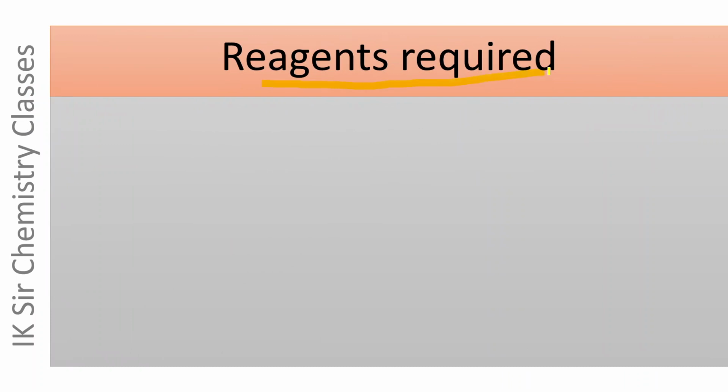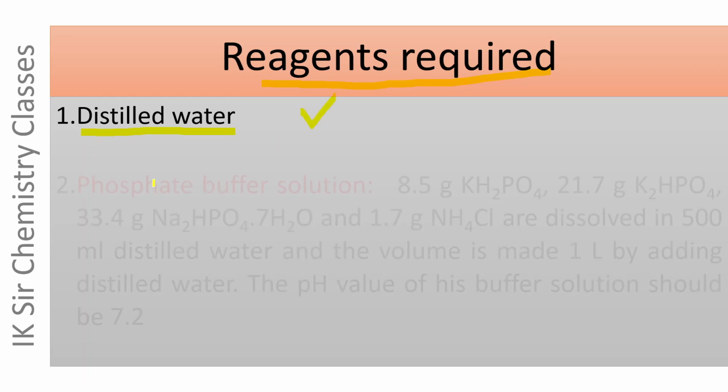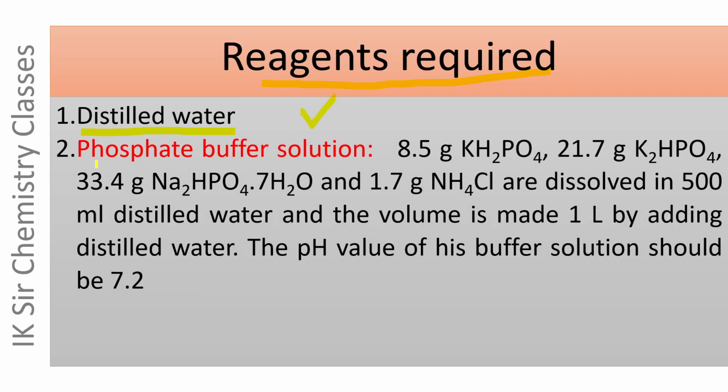Reagents required. First of all, we need distilled water to dilute the given water sample. Phosphate buffer solution.